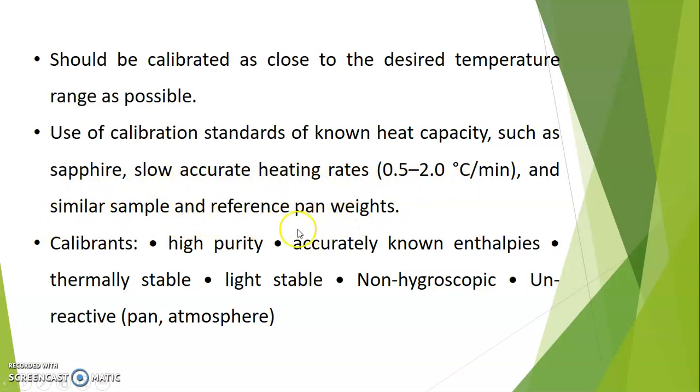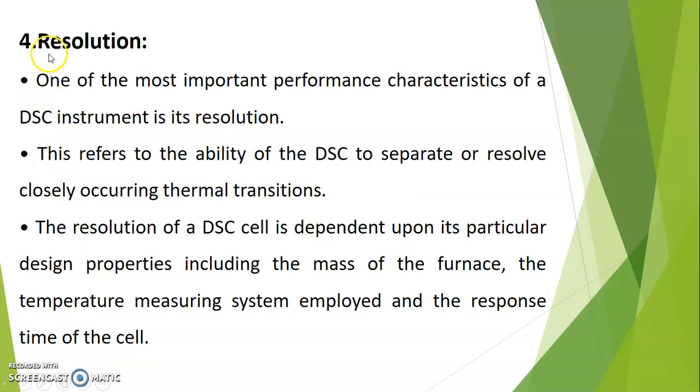and reference pan weights. Calibrants should contain the following characteristics. It should have high purity, accurately known enthalpies, be thermally stable, light stable, non-hygroscopic and unreactive. Okay, so these are some characteristics of calibrants. Next point is the resolution.